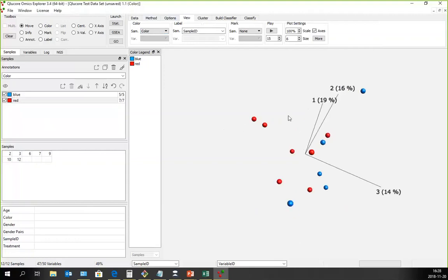Can be very useful if you want to add extra information, if you got extra information that is applicable to your data set from external analysis or from a database and things like that. So that's 3 little features that are pretty new to Omics Explorer and that are available to you all, and which not all of our customers know about because they are new, as I said.